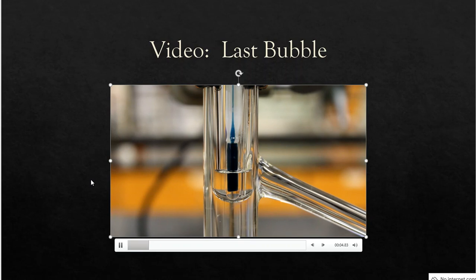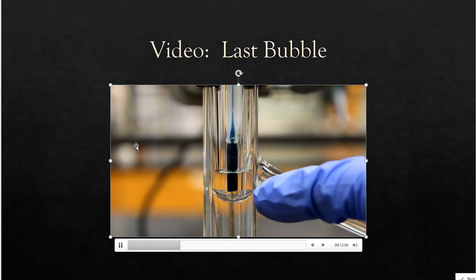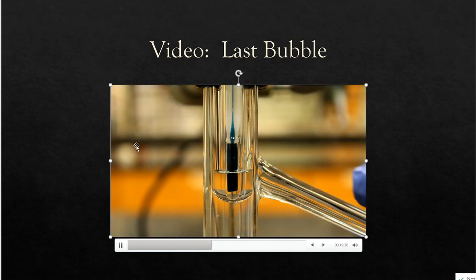At this point, my bubbles have tremendously slowed down. As you can tell, they're starting to come out of the capillary slower and slower. And I'm getting another one, slower. And it looks like that last one was the last bubble that we caught on camera together. All right, so now at this point, I'm going to read my thermometer and see what temperature this happened at. Good for us. Look at what we did.